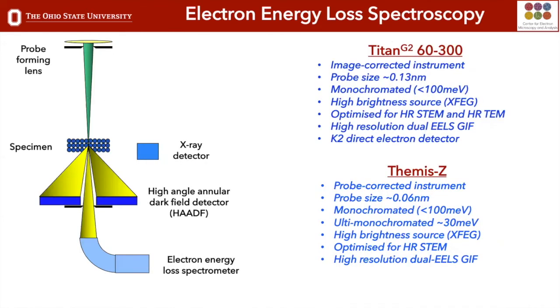And then you can show this. So the other type of spectroscopy in our microscopes is EELS. And you can think of this almost as the, well, kind of as the inverse of X-ray, right? So we fire electrons out of our gun at a very specific energy. We know what the voltage is. And they go through the sample.